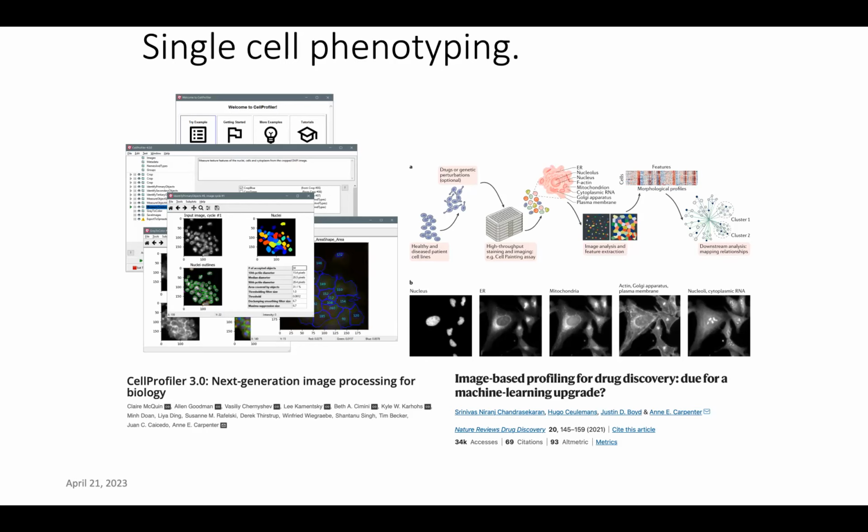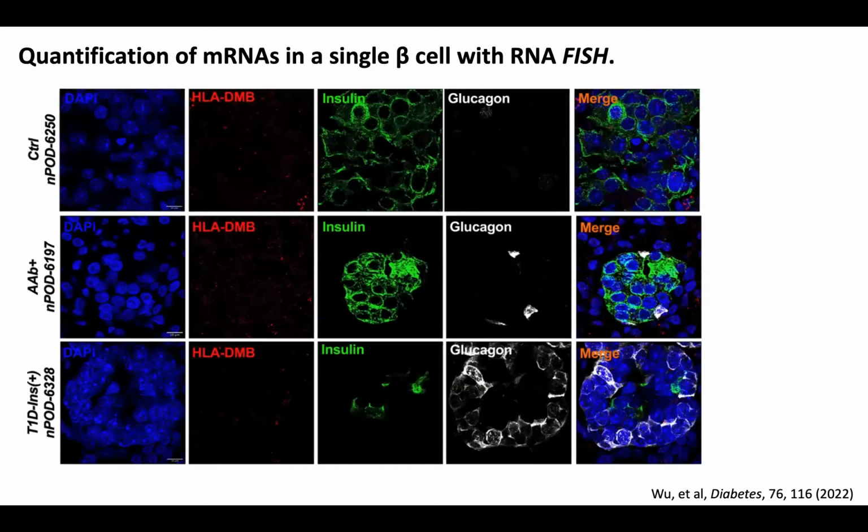So this is used as a metric to do a lot of interesting investigations. My rationale is that morphology is a very general thing compared with the RNA locations, because RNA locations are highly entangled with the cellular functions and the cellular activities. So I think if we use the RNA locations in a single cell as the feature to do single cell phenotyping, that should give us more accuracy and more information from sample to sample. But this idea was formulated a pretty long time ago, 5 or 6 years ago, when machine learning and AI was emerging as an important tool for scientific research.